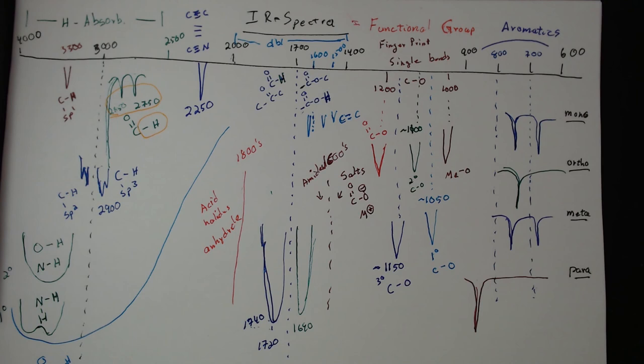Those are the distinguishing features of the aromatics. Let's review the purpose of infrared spectroscopy: the infrared gives you clues of what could be in your compound, but more importantly, what is not in your compound. If there are no OH or NH absorptions, those cannot be present. No triple bond, no carbonyls, no aromatic peaks — you can rule things out. Hopefully you won't need to investigate the fingerprint region unless you're really desperate.